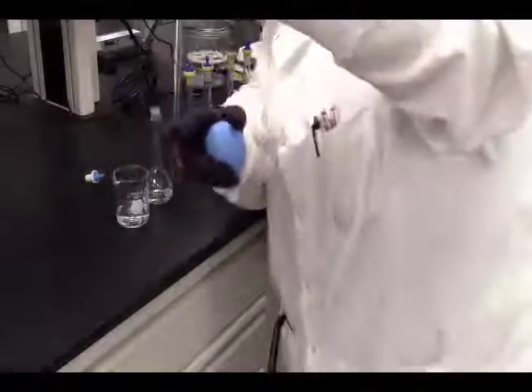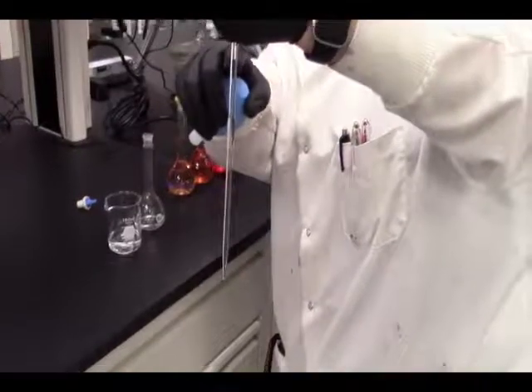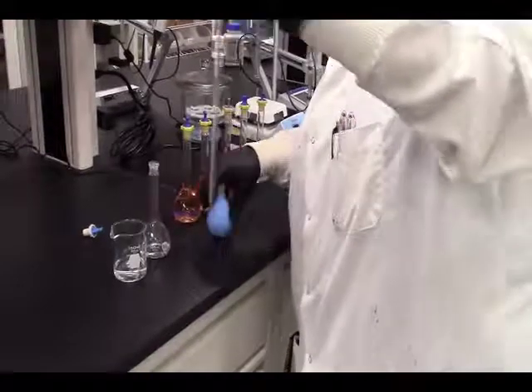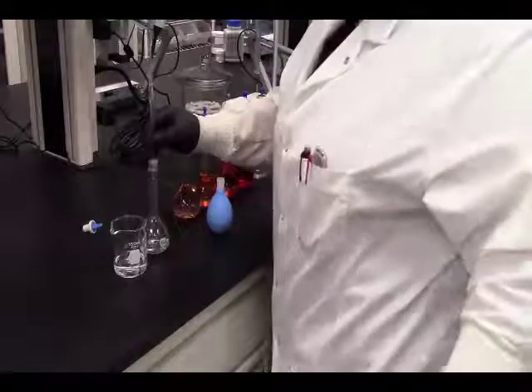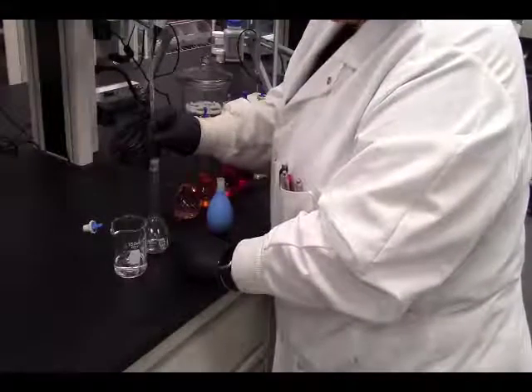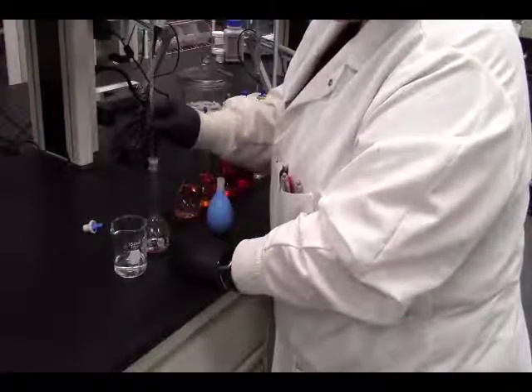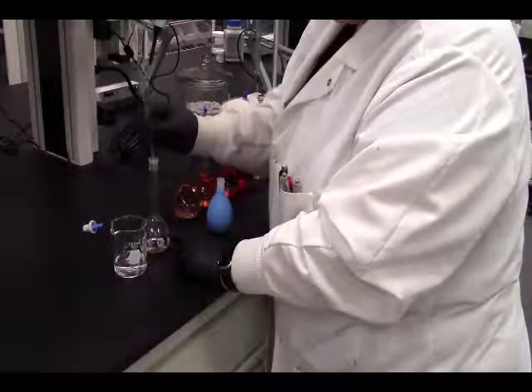As you can see, we have 1 milliliter in there with the bottom of the meniscus just sitting on the line. We're going to put that into our volumetric flask. Now, this volumetric flask already contains our hydroxylamine, our orthophenanthroline, and the sodium acetate. And remember, you don't blow out. This is to deliver.